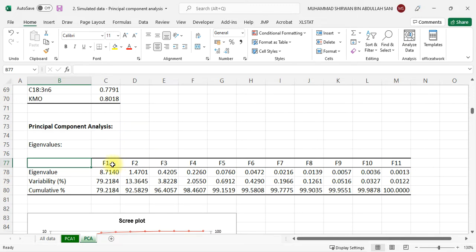Within the x-axis versus y-axis, 2 dimensions, 92% of the data are really used in this study. That's enough. It's quite good. The nearer it is to 100%, the better. But in our study, since we know the plotting will be x versus y, only 2 factors or principal components will be used. 92% are being used, meaning that they are meaningful in our study.